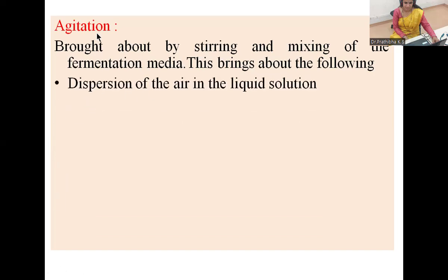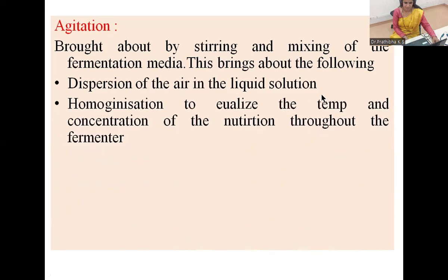Why are we using agitation or impellers? For the dispersion of the air in the liquid solution. For the proper dispersion of the air, whatever the sparger sends into the medium, that air must be properly dispersed throughout the culture medium. For that reason, we are using the agitator or impellers. The purpose: dispersion of the air in the liquid solution.